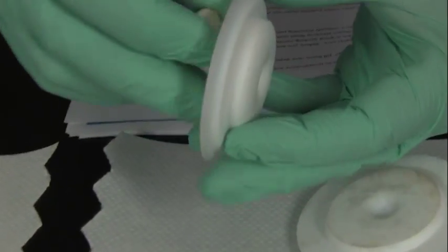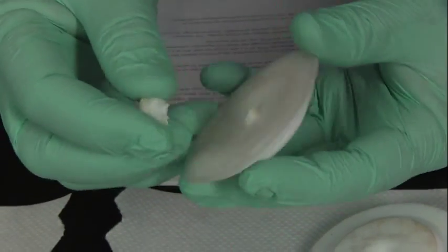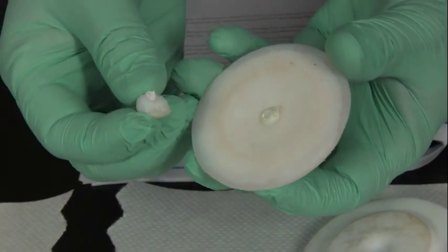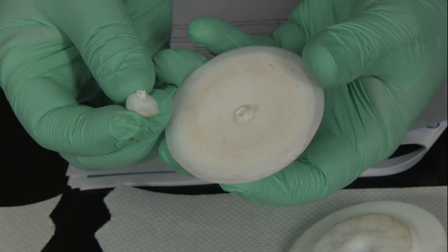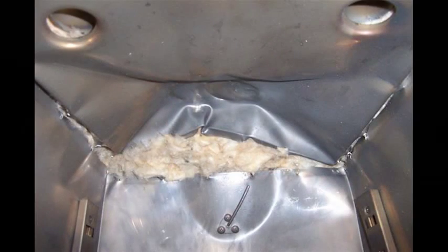Additional pressure extrudes the PTFE dimple further until it violently releases the stored kinetic energy in a rupture. The chemical contents violently eject, which can be dangerous to your hearing and health. Physical damage to ovens is common in such rupture incidents.